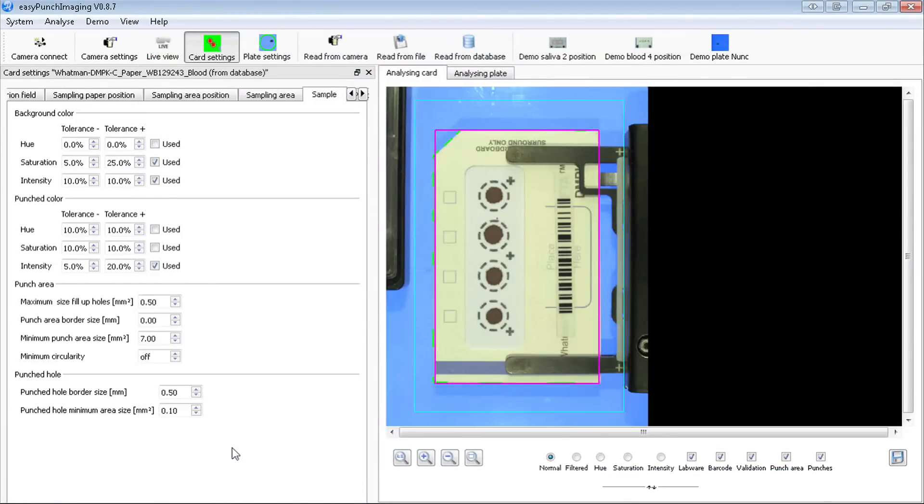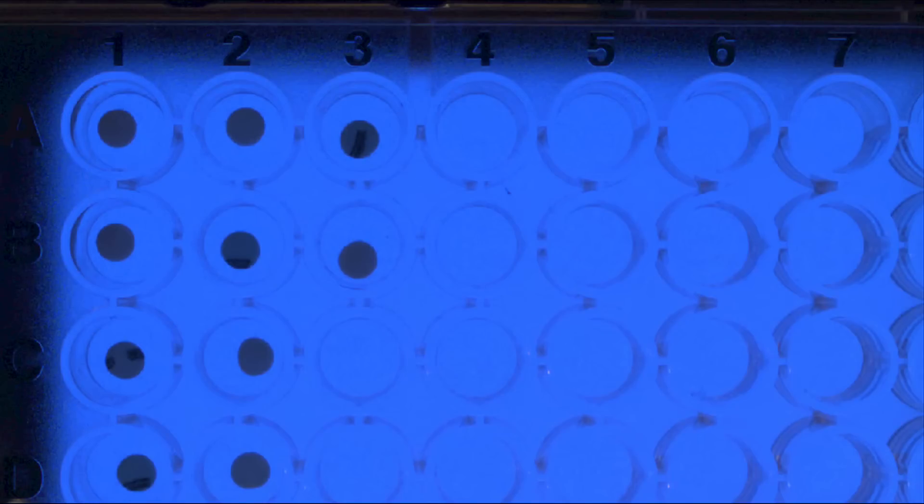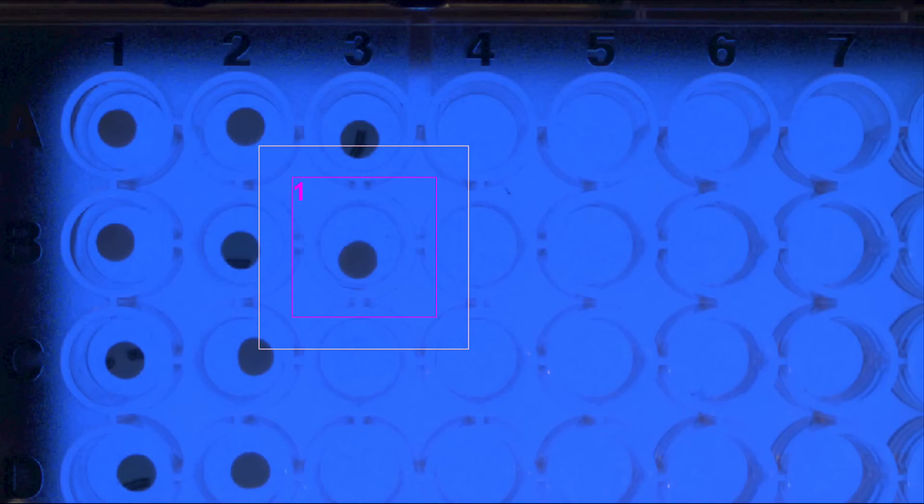It can be exported to an LIMS system. After each punch, the position of the punched disc in the target well is confirmed. This makes sure that the right punch is in the designated well.